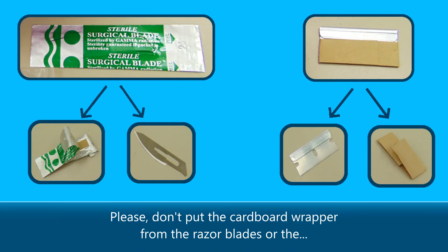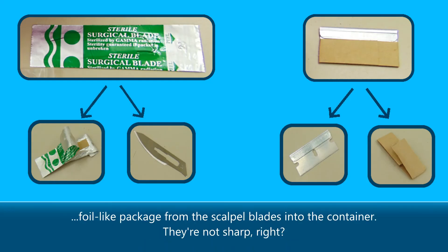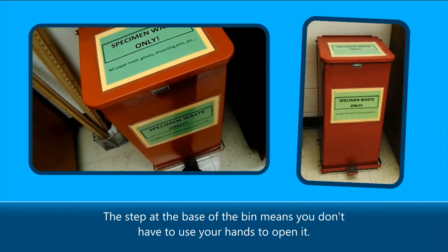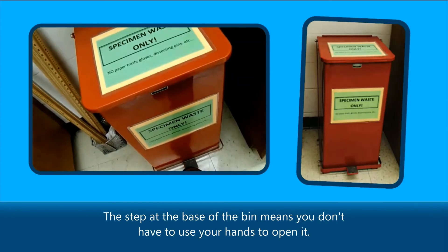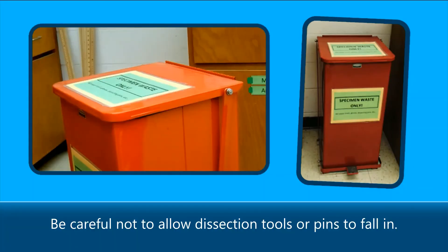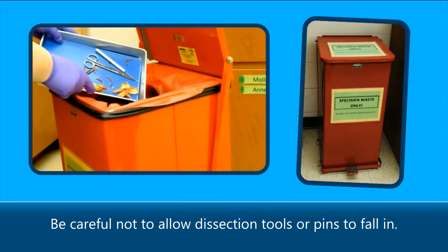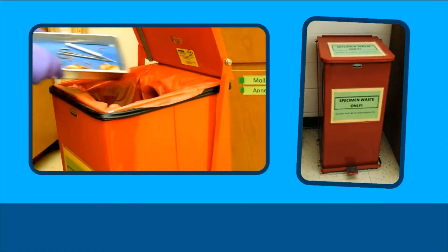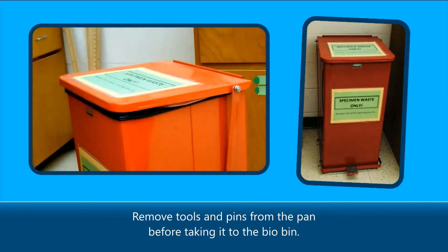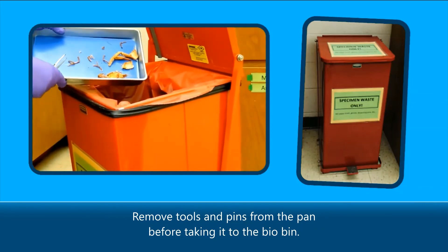Please don't put the cardboard wrapper from the razor blades or the foil-like package from the scalpel blades into the sharps container — they're not sharp. Place any broken or rusty blades inside the sharps container, unless you've used the blade remover, as it's a sharps container too. The biohazard bin is for disposing of specimens and their parts. The step at the base of the bin means you don't have to use your hands to open it. Be careful not to allow dissection tools or pins to fall in. Remove tools and pins from the pan before taking it to the bio bin.